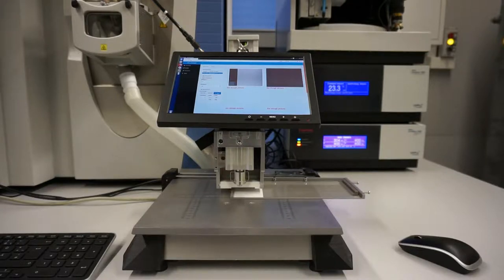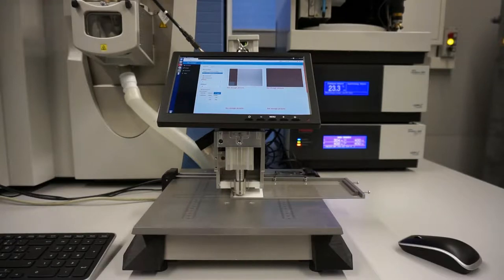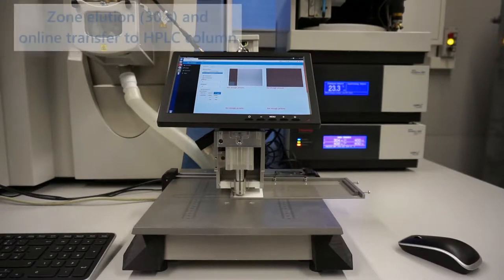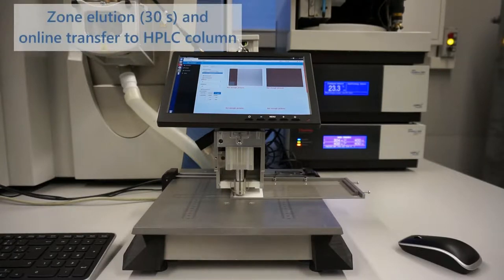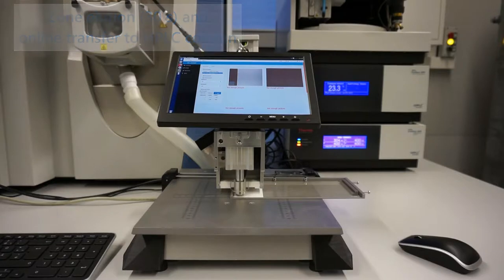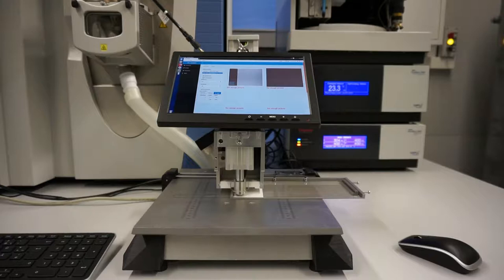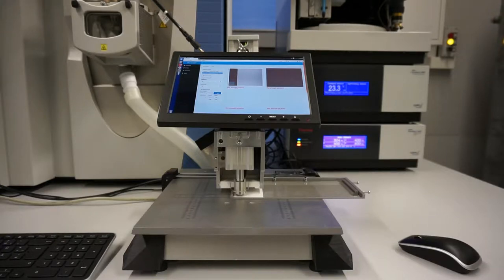The interface automatically moves to the first elution position, lowers the elution head and switches the six-port valve to elute the analytes from the plate directly into the monolithic column. The start signal for the HPLC pump for starting the chromatographic run is provided by the interface, shortly before the elution head is lowered.